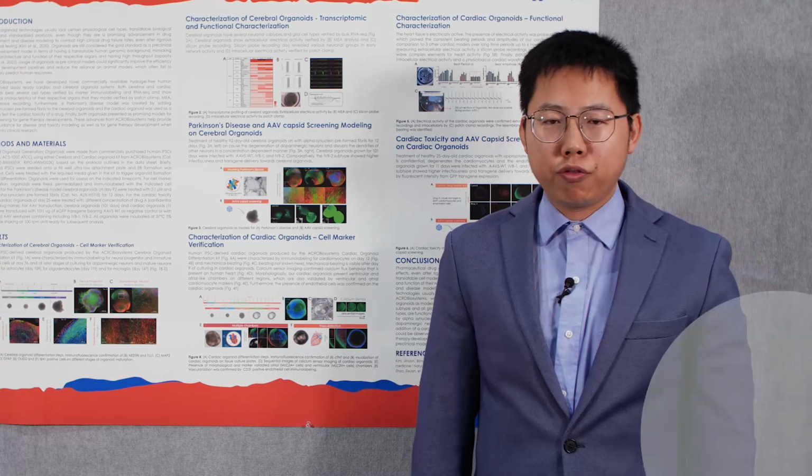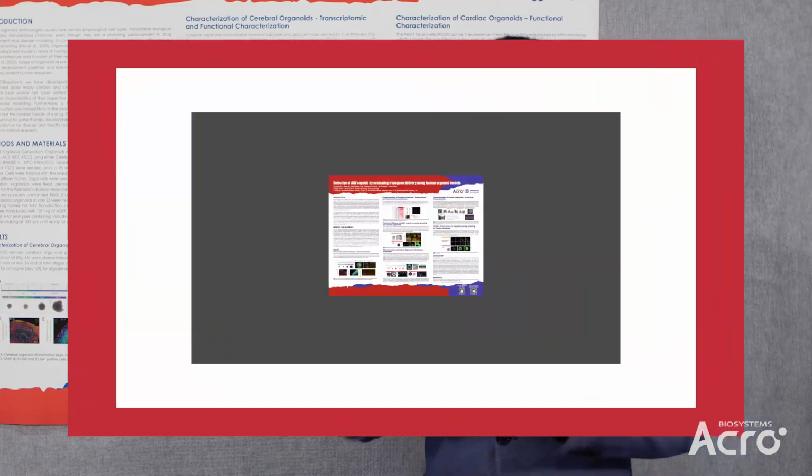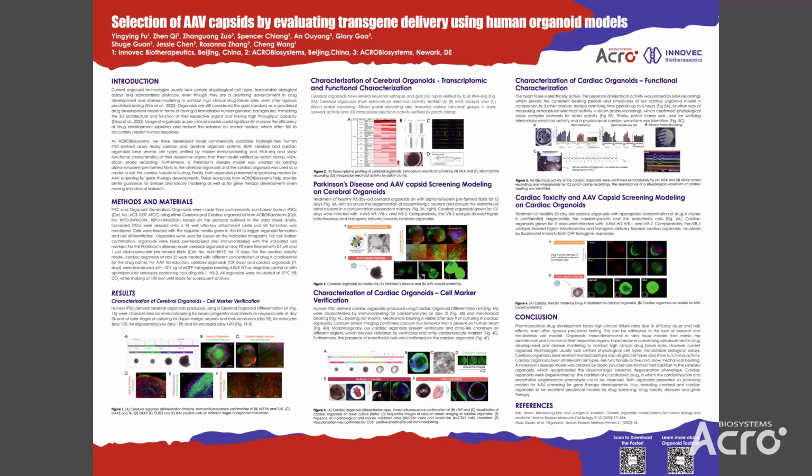Today it's a great pleasure for me to present our recent work and recently developed products. It's about the selection of AAV capsids by evaluating transgene delivery using human organoid models.